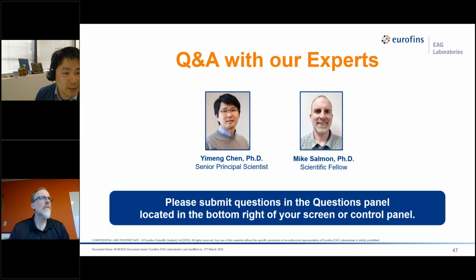resolve. So in that case, sometimes you can rely on the non-overlapping peaks with the natural isotopic abundance. So you can mathematically decompose the peak and calculate how much of the ions can be associated with one element instead of another. So my suggestion will be to first try to improve your mass resolving power as much as possible, and use peak decomposition for more accurate compositional measurement.